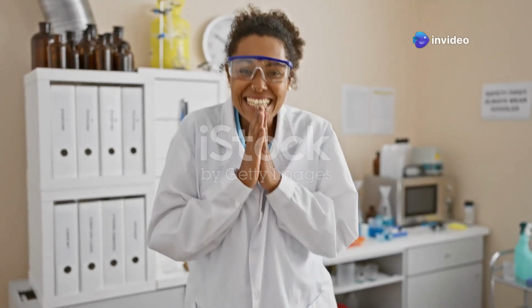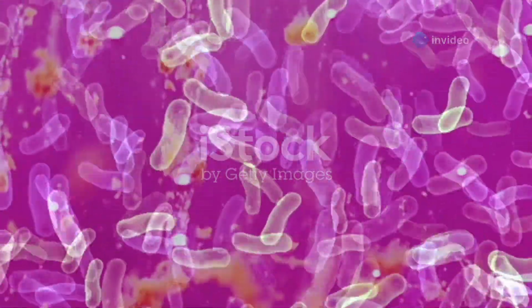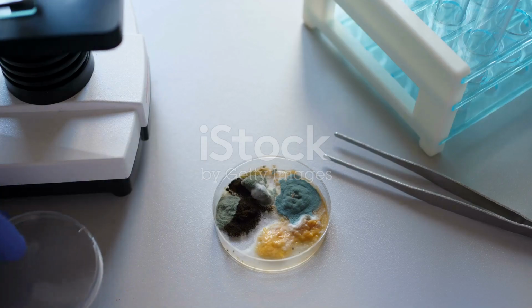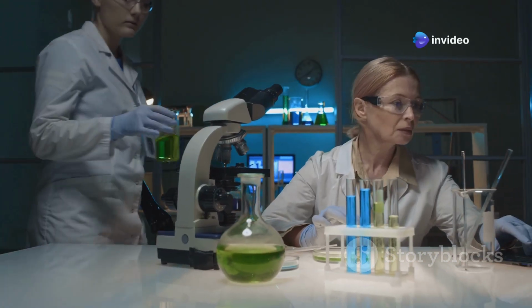Hey there, science fans. Today we're diving into the fascinating world of bacteria. Those tiny organisms that are everywhere. But how do we tell these microscopic critters apart? That's where gram staining comes in. It's like magic, but with science.